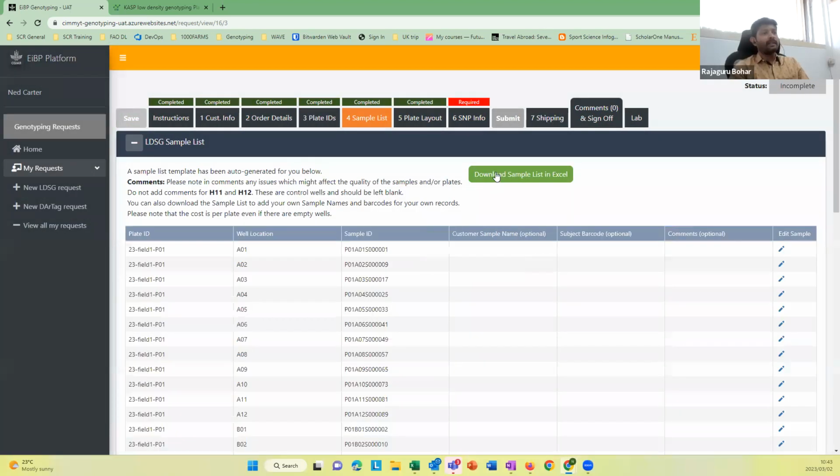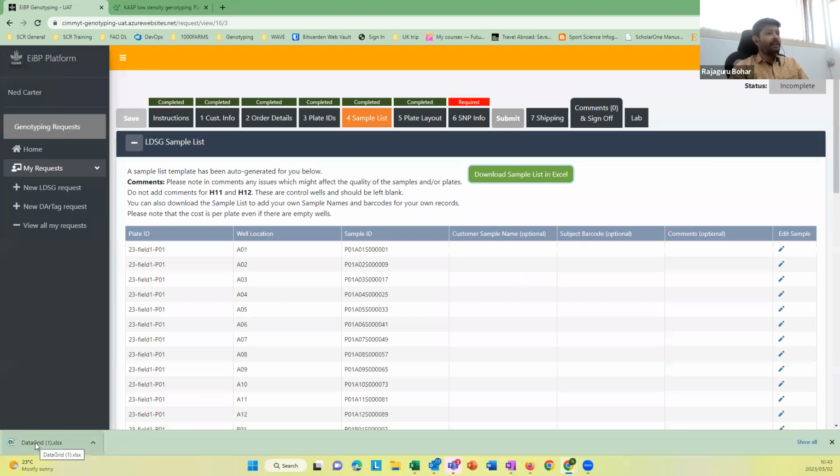Yeah, thanks, Singh. There's a question from Gabby. I guess this is for Nick. Could you please repeat the sample list step?